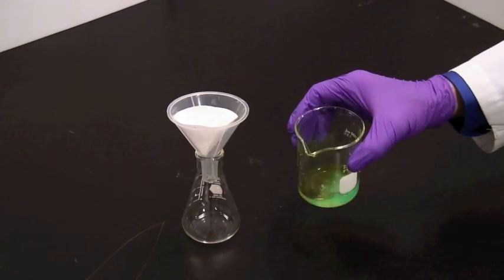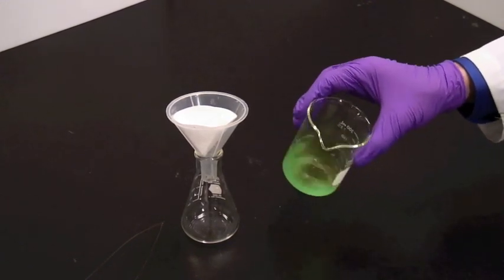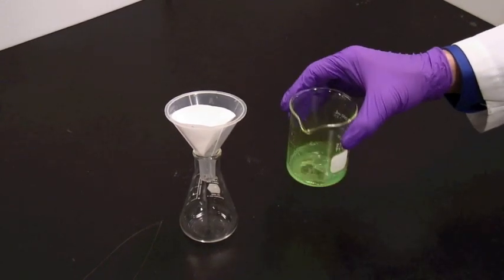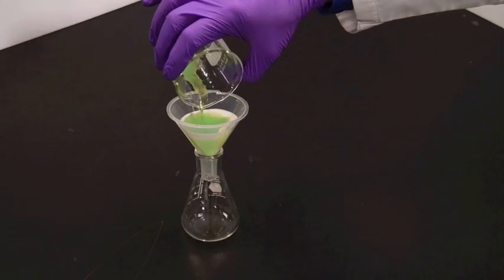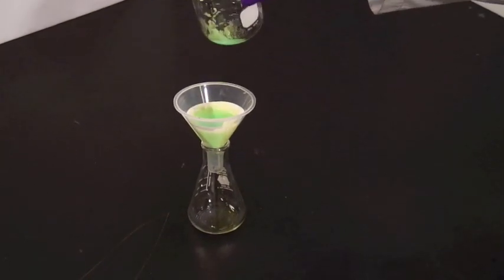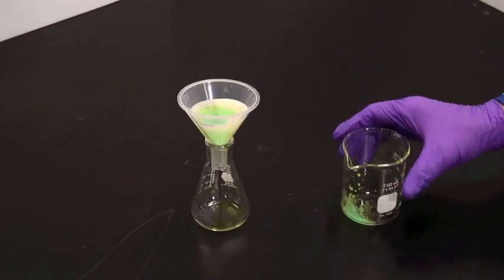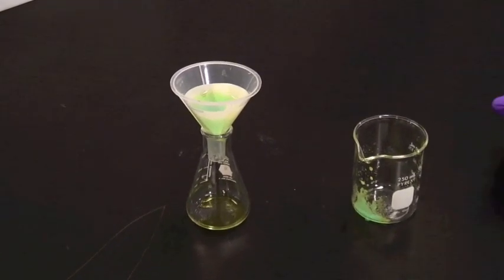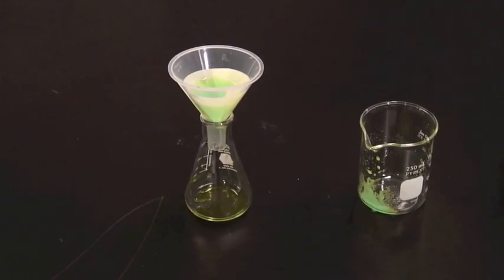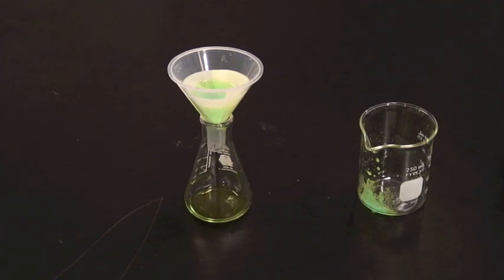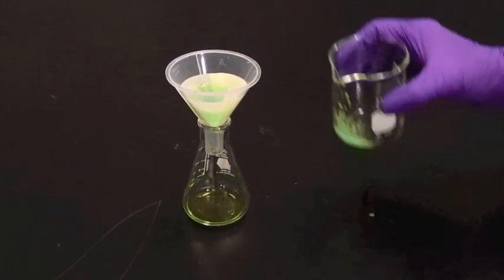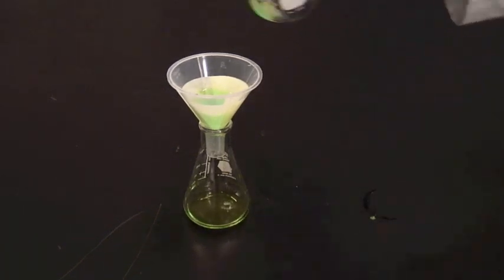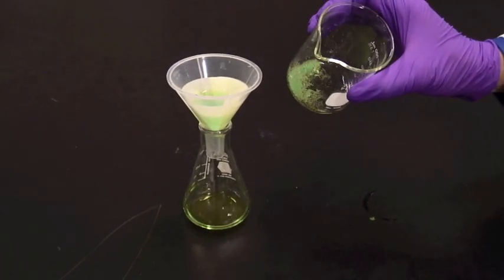Take your mixture of solid and liquid and swirl it to suspend the solid in the liquid and pour. Be careful when you're pouring that you don't overtop the liquid as it goes through. Otherwise, it'll just run down the outside of the filter paper, and it won't be much use.